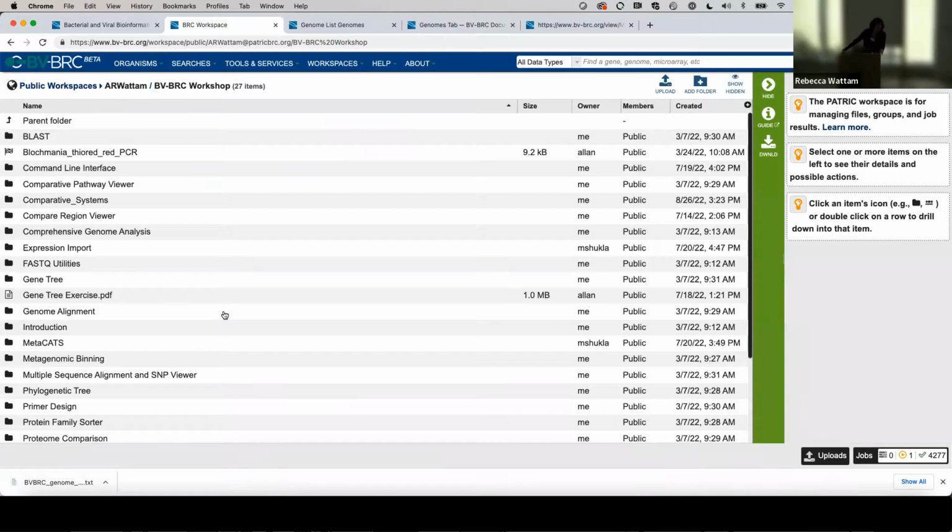When you're beginning an analysis, this is where I always meet my first moment of indecision. I've sent my organism DNA off to the sequencing lab, and they've sent me back the reads. So here's the big question: do I want to know how good a job I did or how good a job they did? There are two services that can help you with that.